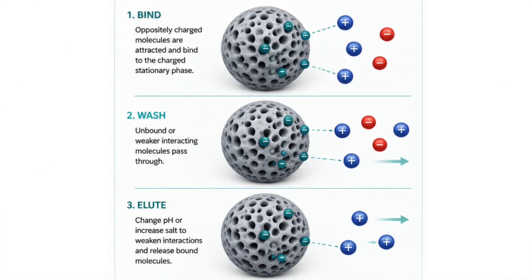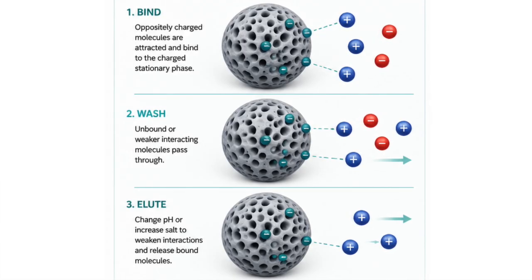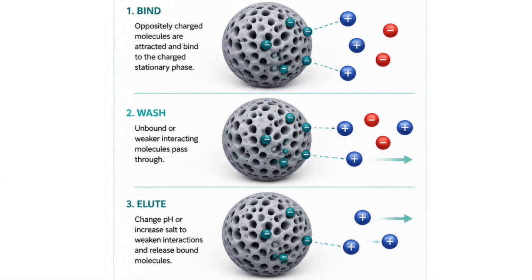The way we get those to stick and then release and move on is we either change the pH a little bit, or we increase the ionic strength of the solution by adding salts.